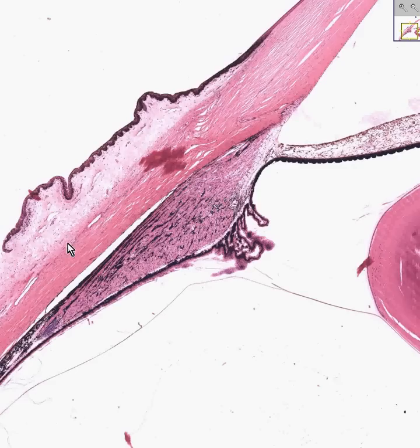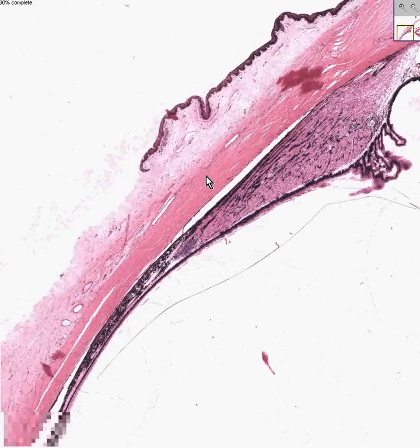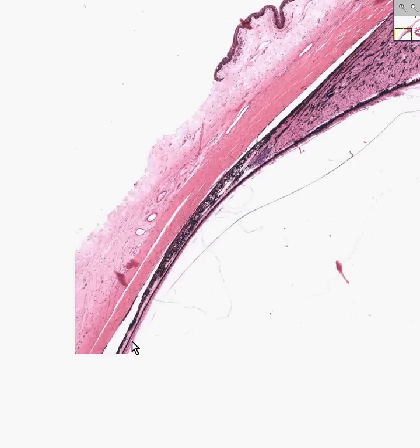Also notice that we have a lot of blood vessels here. And also notice that here's that RPE coming all the way down eventually towards the retina. But also notice we don't have a retina. We have a choroid. We have a sclera. We have connective tissue surrounding the sclera. We have a bulbar conjunctiva.